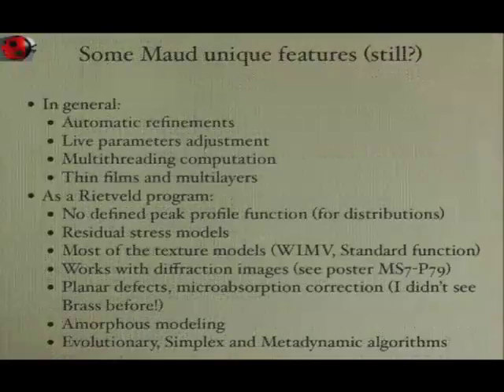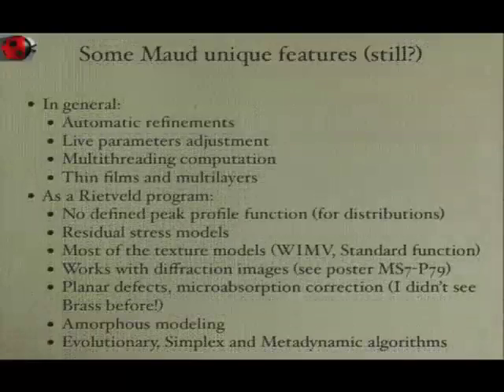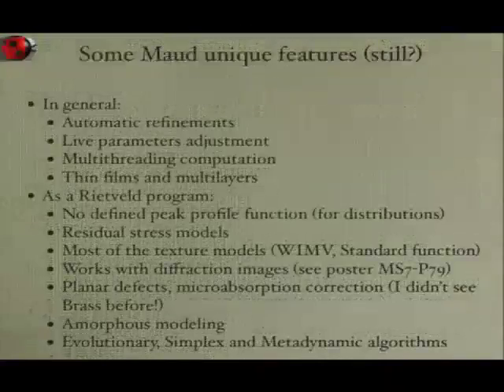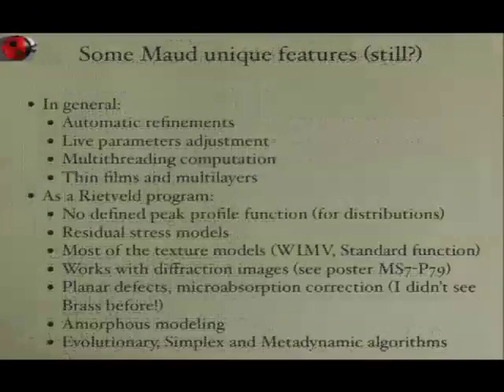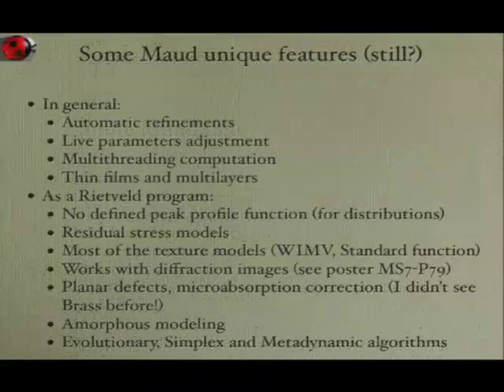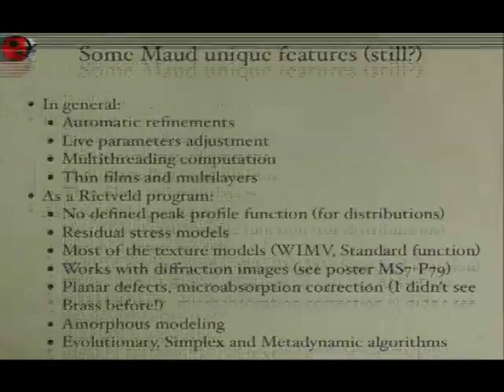Okay? Yeah, it works with diffraction images, okay? So in MAUD, 10 years ago, we were using Fit2D, but we realized that the problem is that we want to calibrate the image during the Rietveld refinement, and especially when we deal with residual stresses, like for example at high pressure, they change the overlays of the images, okay? And Fit2D treats them as a tilt of the detector. We want to separate the tilting error of the detector from, for example, the residual stress, the high pressure or whatever. So we actually fit the center of the image and so on.